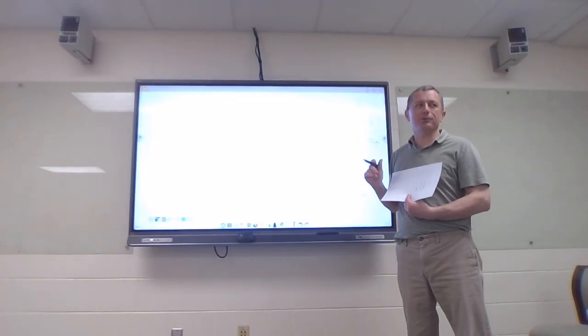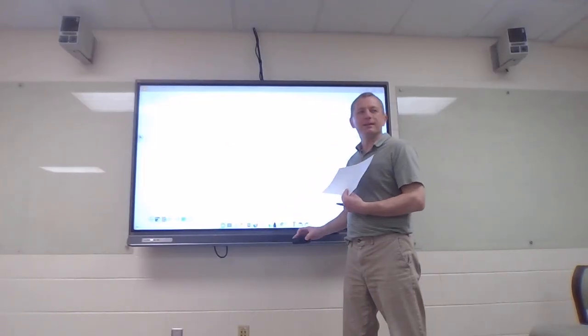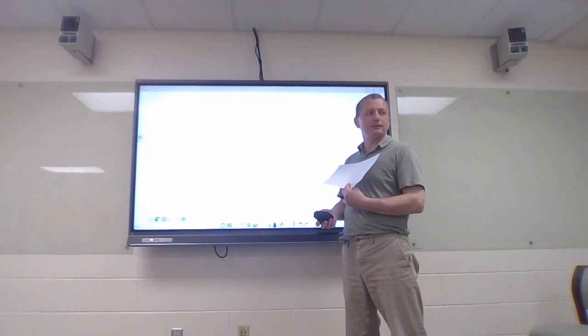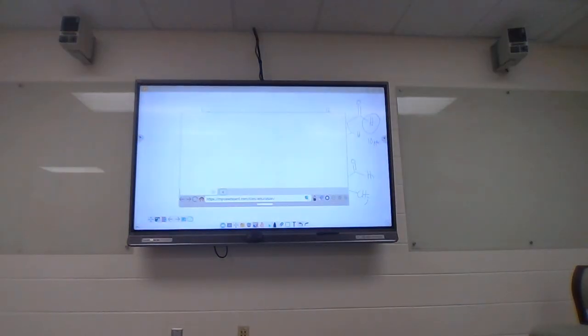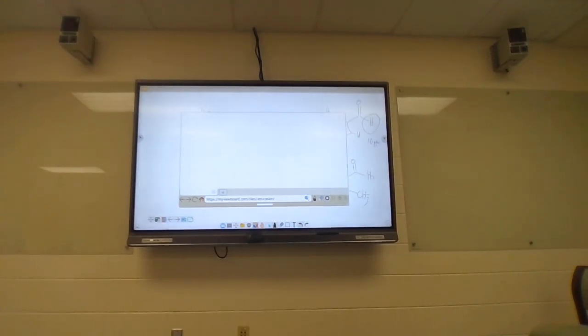You're not going to find that in the chemical shift table. I'm just telling you. I'm giving you 2 examples, by the way: ethyl ether versus ethyl acetate. Okay, let's go back. Look at spectrum number 2. That is hydrogens on a carbon next to an oxygen that's not part of an ester, just an ether. 3.5-ish or so, right?